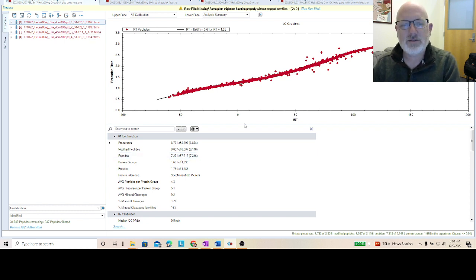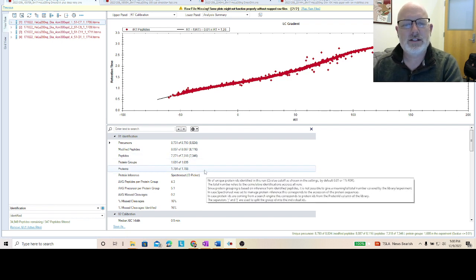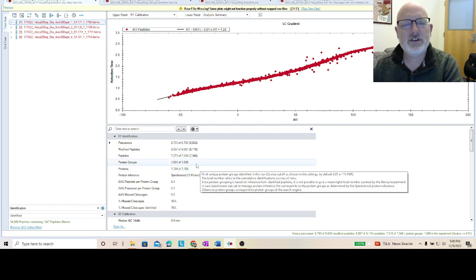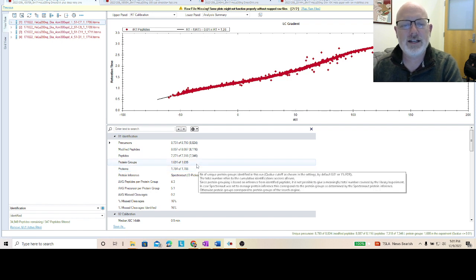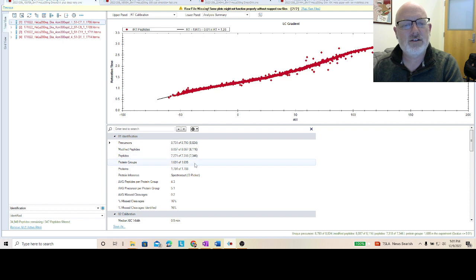And so let's look at the number of peptides and the number of proteins we get. Okay. So number of proteins and protein groups, around 1,700 to 1,800, depending on if you want to use protein groups for the proteins. It's probably worth a video to talk about the difference. Just long story short, this depends more probably on your database than anything else. Okay, so around 1,700 to 1,800.